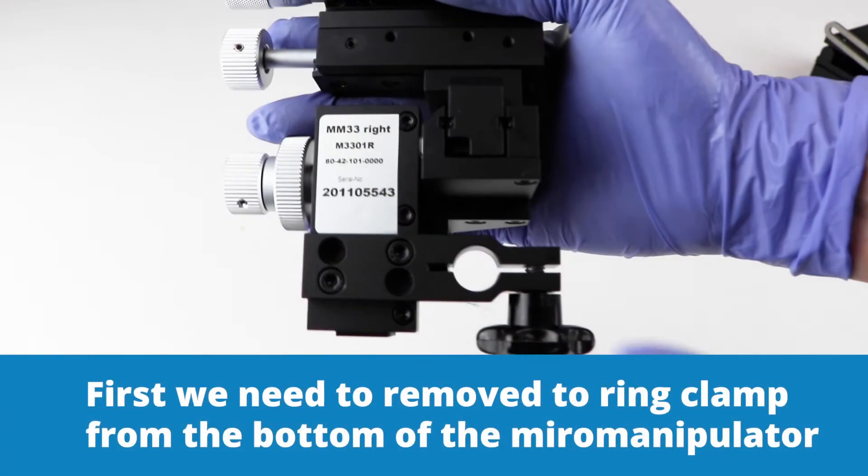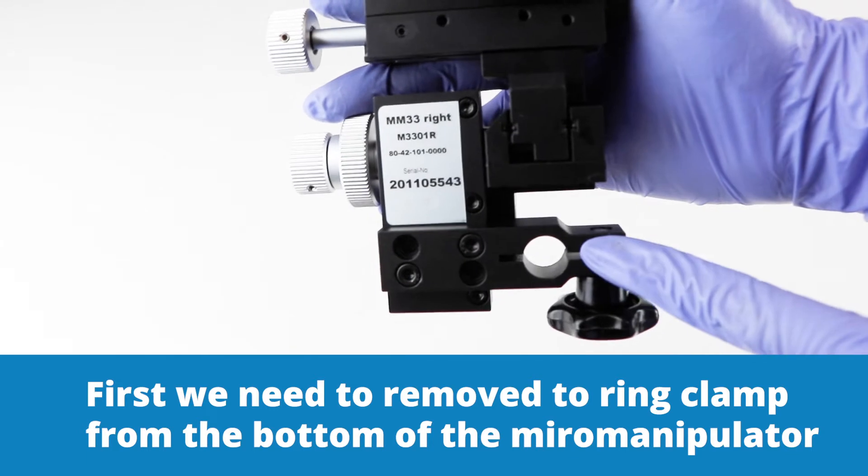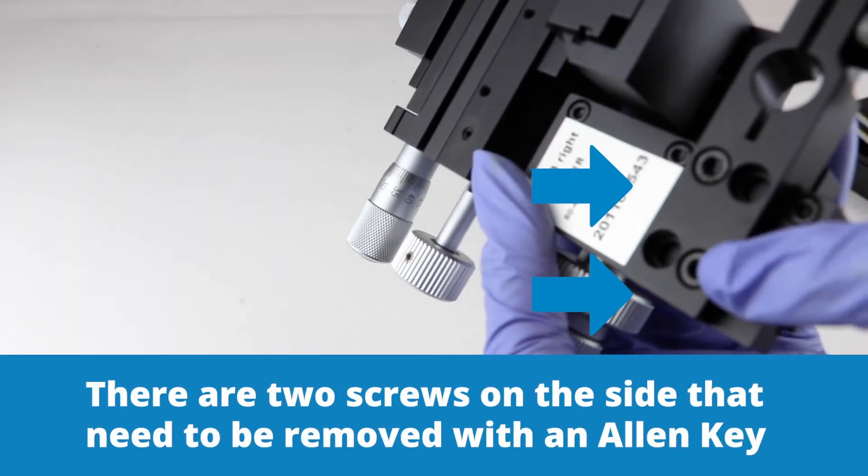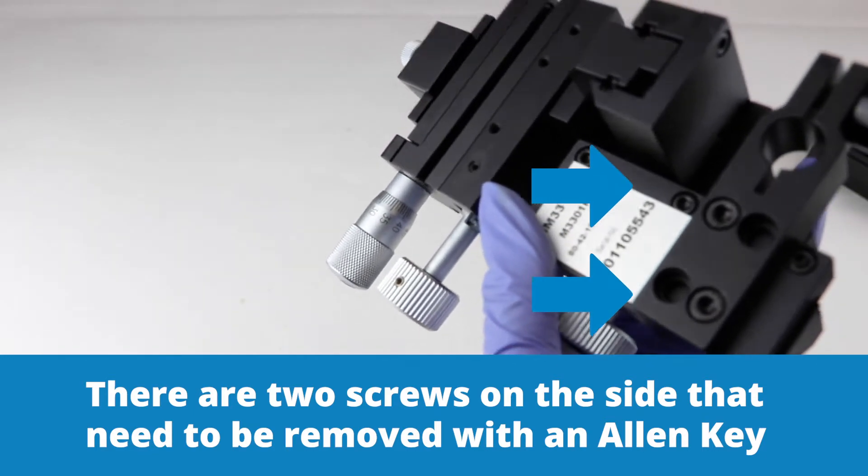The first thing we need to do is remove this ring clamp on the bottom of the micromanipulator. There are two screws that we need to remove with an allen key.